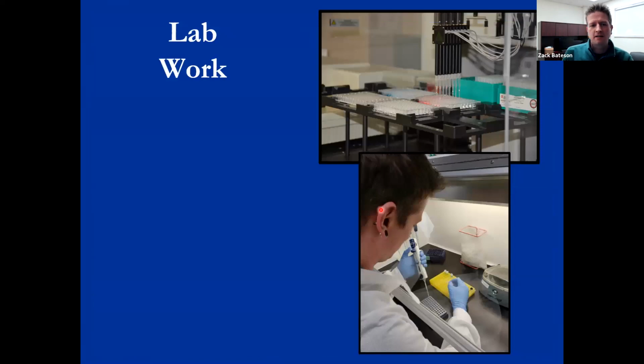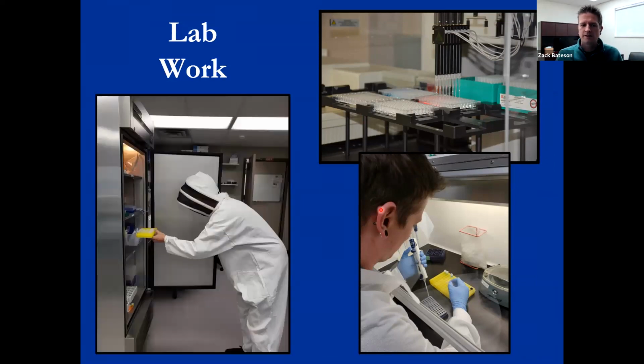And then you get it back into the lab. We have a liquid handling system for our DNA extractions. And then of course, a picture of me doing the PCR setup. When you're running so many samples, you get a little bored, so you've got to throw on that bee suit and see if you can do lab work. Usually it doesn't really work that well, especially with the hood on. You've got to take the hood off. But we try to have a little bit of fun in the lab too.